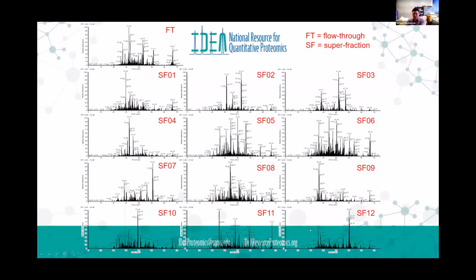And then the ultimate result of that is this figure, which I showed yesterday. You can do this with 13 hours of instrument time, occupied fairly evenly across the board with peptide analysis if you do the separation strategically.